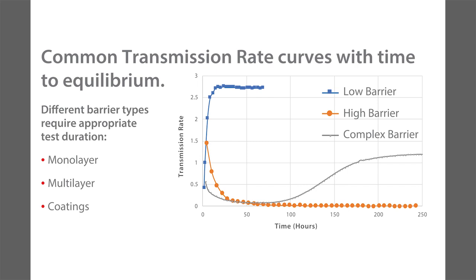If you think about testing times, someone could run the test and say, it's done here because it's not changing. So having a criteria of what is equilibrium is important whenever you're doing testing, and being consistent with it. Because the ASTMs don't fully mandate what equilibrium is. They say it's an output that's not changing over time. And if you think it's not really done, come back later and check it.